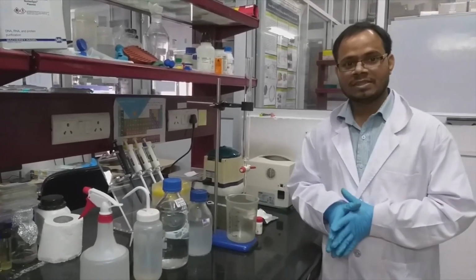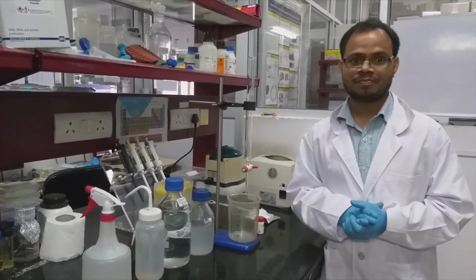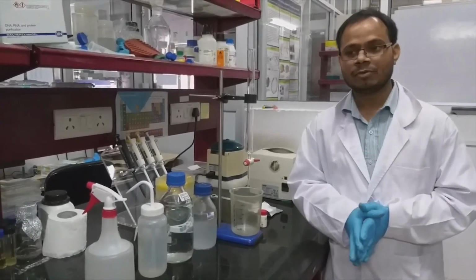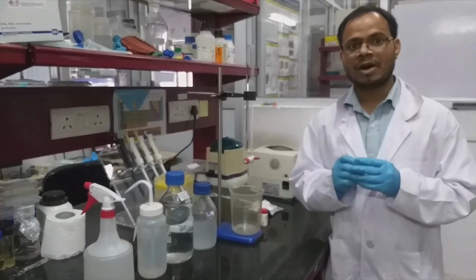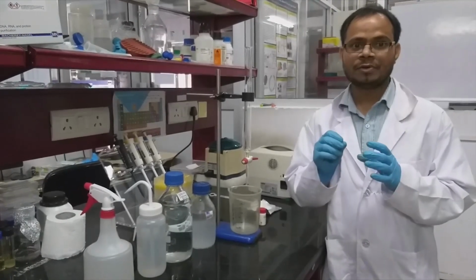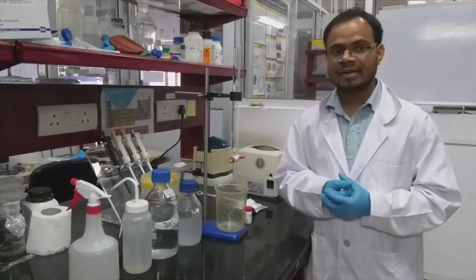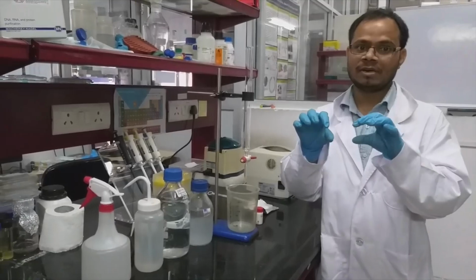This matrix contains beads which have small pores. Suppose you want to separate a mixture of molecules from 1 kDa to 200 kDa. The small molecule of 1 kDa will permeate or diffuse into the pores in the beads, and the bigger molecule of 200 kDa will be excluded from the pores.